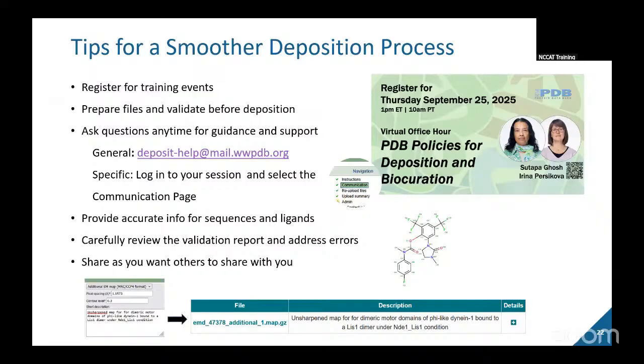Yeah, this is the logic for the maps. Now the derived data, the coordinates, they allowed it. You can see, for example, during the pandemic, people were rushing to put these spike structures out. And then we see later on, people are doing a lot of versioning. They have time to access the older versions.